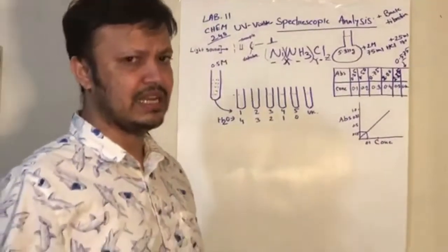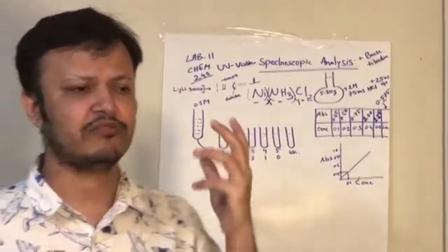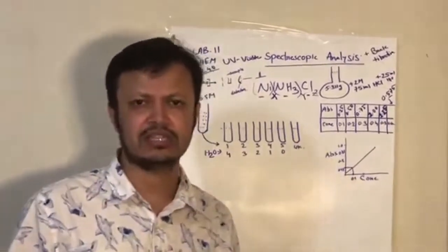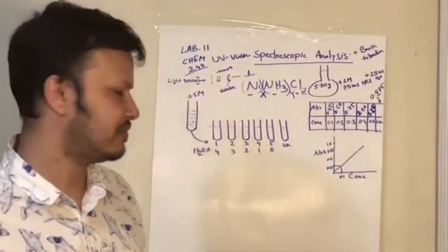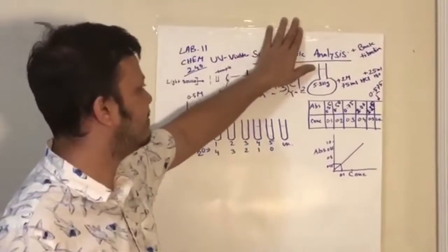So you know what is the back titration. In the back titration, we normally add an excess amount of a known concentration, then that excess amount we can find out with the help of another known concentration of a substance. So UV visible spectroscopy and back titration.